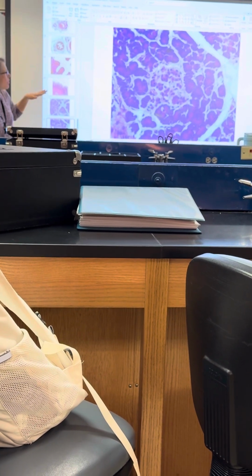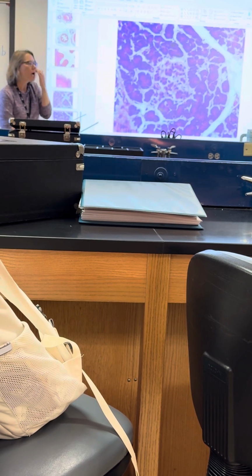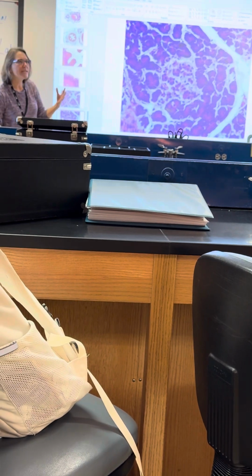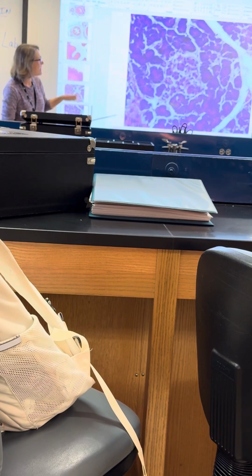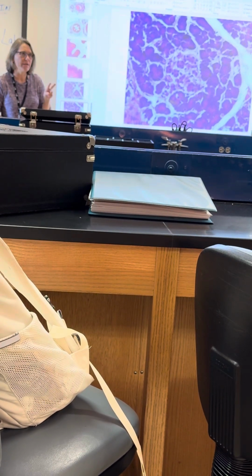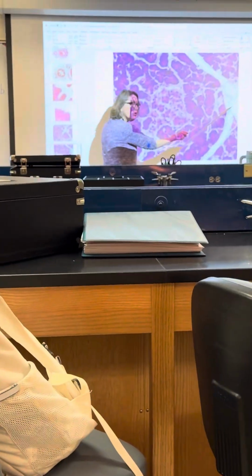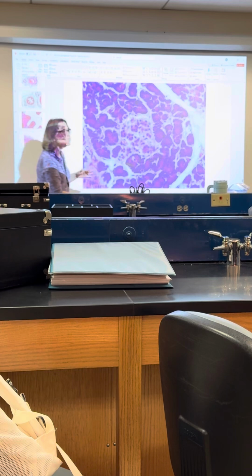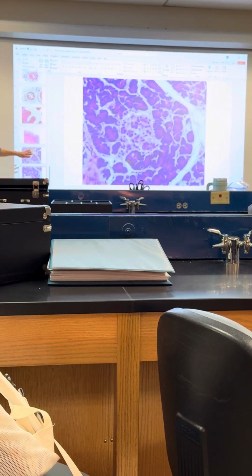There's a couple of things here. How much detail did he want you to go into? Did he have you do the dark areas versus the light area here? Okay, so what kind of cells are these? Acinar cells, and they secrete digestive enzymes, okay? Is it exocrine or endocrine? It's exocrine, because those secretions go into these ducts locally and get dumped into the small intestine for digestion, okay? So that's over 90% of it. Anybody know what gland we're in here? We're in the pancreas, yeah.